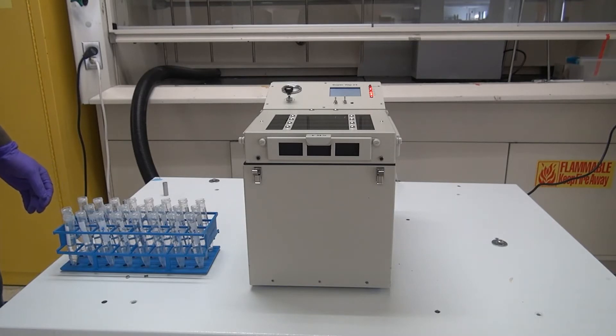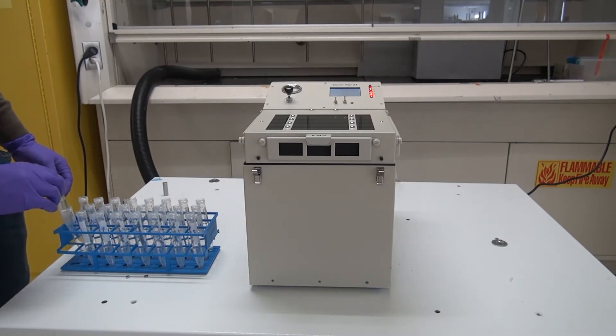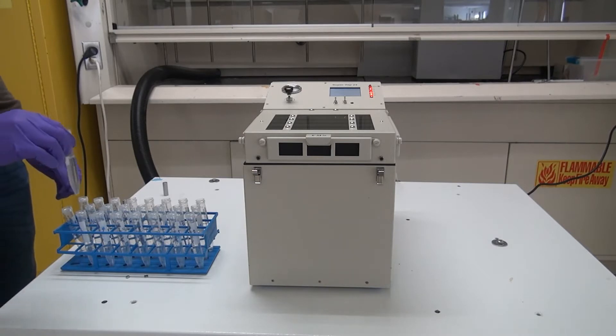So to the left we have a tray of 24 samples. That's two runs off of one easy PFAS system, and as you can see we have the vial.